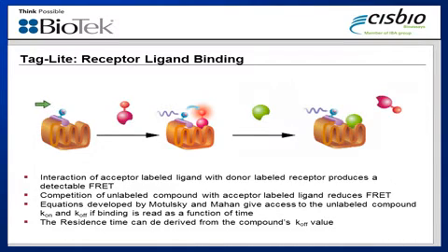A labeled ligand, shown here, is then added to the well, and as binding occurs, energy is transferred from the donor fluor to the acceptor, and then this causes the ratio of the signal from the acceptor compared to the donor fluor to increase. The ratio continues to increase as the number of binding events also increase, eventually reaching a plateau over time, which again, as previously mentioned, is usually what has been monitored with these types of assays.